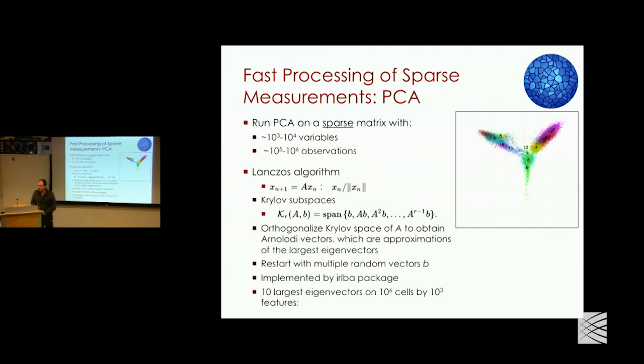And the sparsity is typically about 1 in 100 order of magnitude for these matrices, the fraction of non-zero. Is there any rough range of order of magnitude for sparsity that you've seen? Well, you're filtering to genes that are... So after QC. Yeah, we do this filtering, but that's what I'm trying to figure out. So, let's say we get about 15,000 genes, but then you have a distribution of molecular sizes. A lot of them can have, let's say, 1,000 genes on average, right? Some will have 300, some will have 4,000 or 5,000.